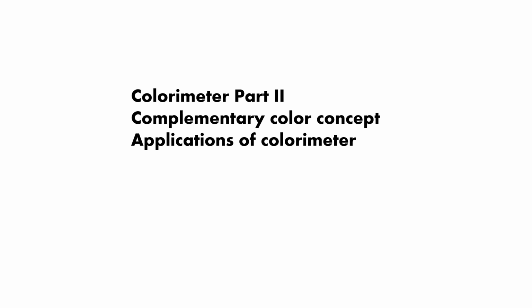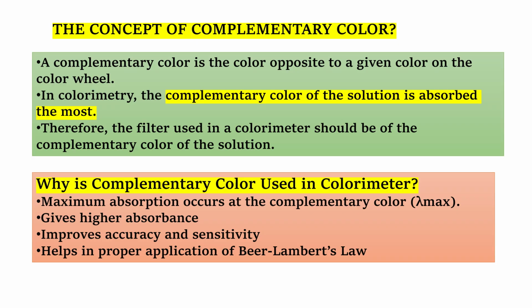We were talking about a colorimeter. Now we are going to see its part 2, that is the concept of complementary colors, how the selection of filter occurs in colorimetry, and the applications of the colorimeter. Okay, so what is complementary color in case of colorimeter?